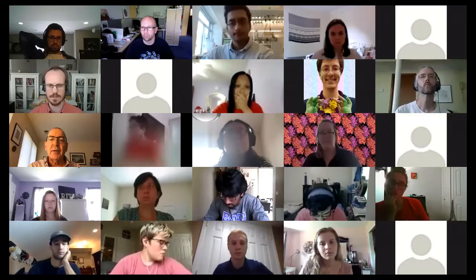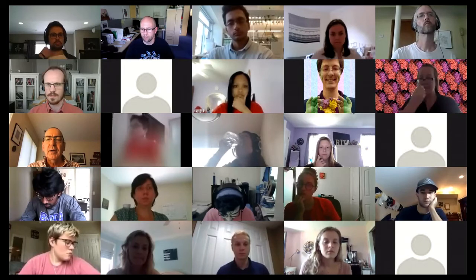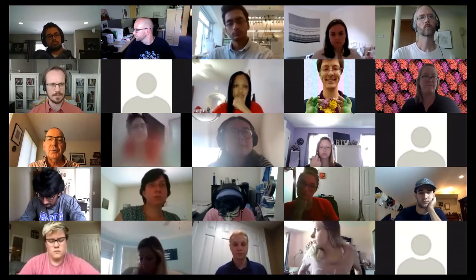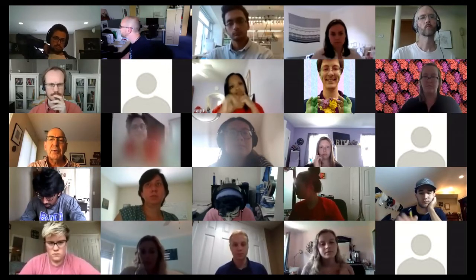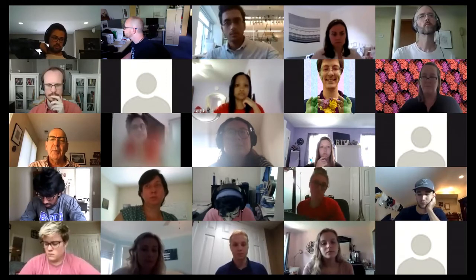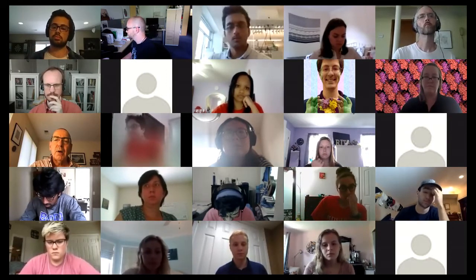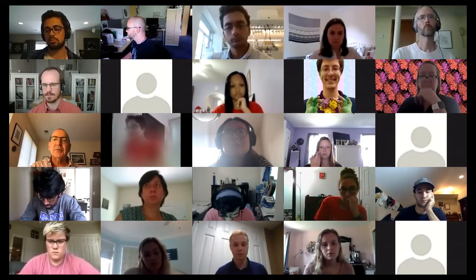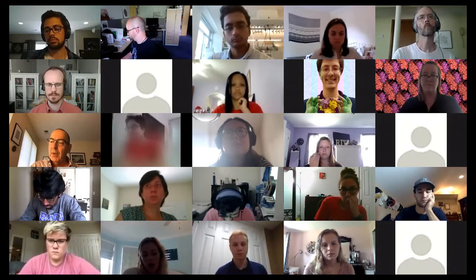Quantitative Biomedicine and a member of the RCSB PDB staff. She goes by Shuchi, and she's going to introduce the training on molecular visualization using the RCSB PDB MolStar tool. And then we'll move into a series of molecular visualization exercises in your respective groups.